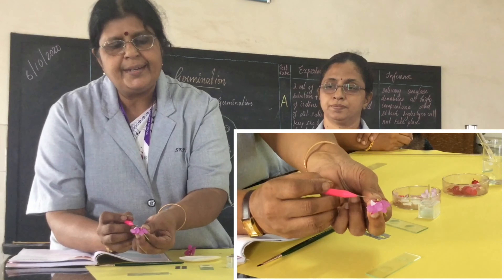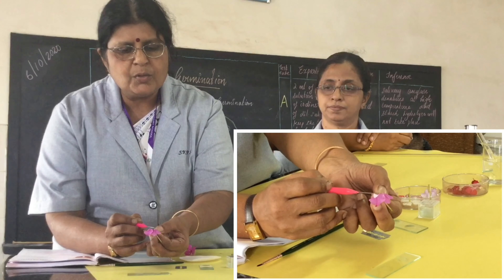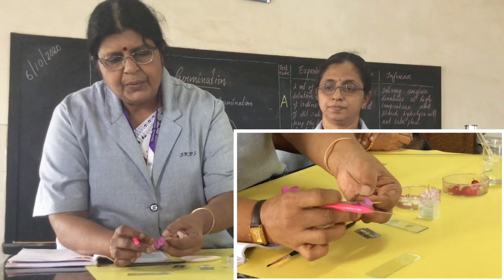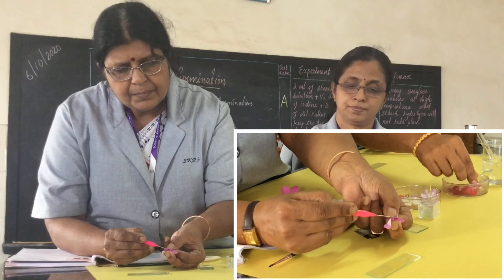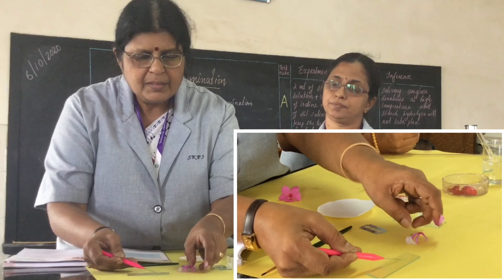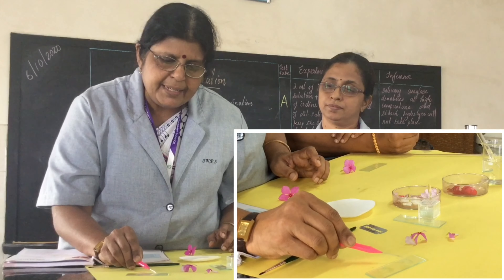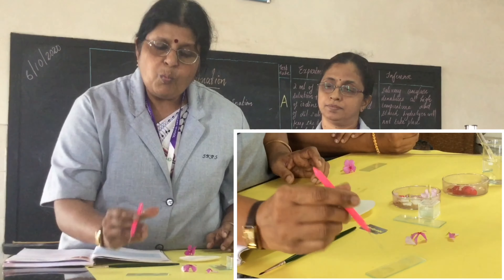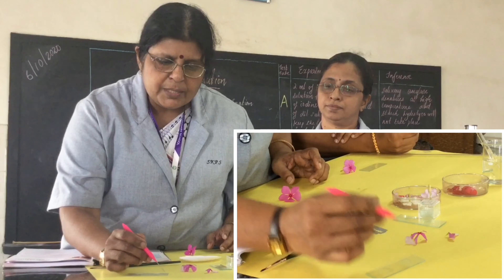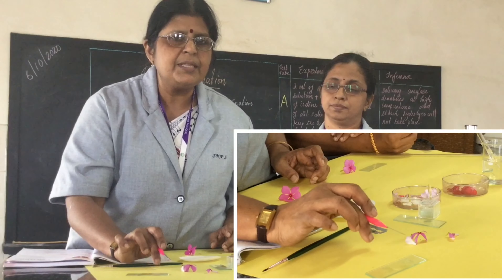You can see an arrowhead — the arrowhead is the anther lobes which contain the pollen grains. Take that anther out with the needle and dust it onto the cavity slide you have prepared with the nutrient medium. Gently press on it with the help of the needle and the pollen grains will come out. Once they come out, remove the anther lobes so that your slide contains only the pollen grains. This is how you expose the pollen grains from Vinca rosa onto the cavity slide.